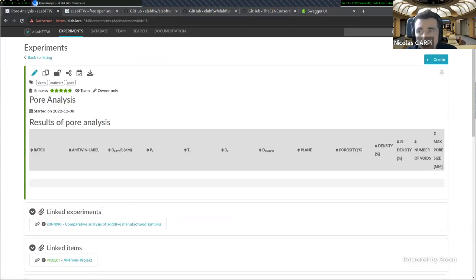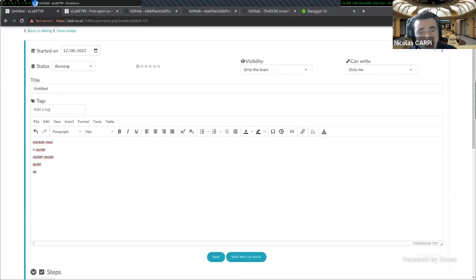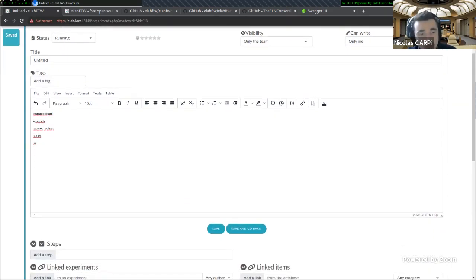So as you can see, if I just click on the create button, I use no template. I just end up with the default template for the team, which I can completely remove, and I am completely free to have some free text. So this is the default stuff. It's free. It doesn't stop you from just doing free stuff.